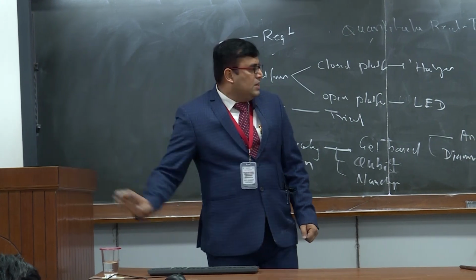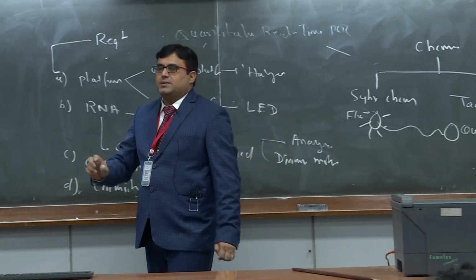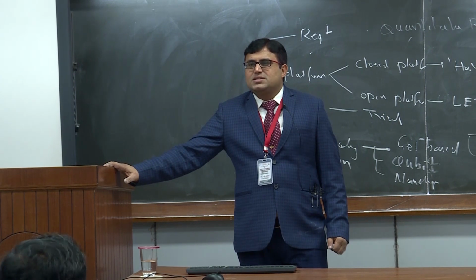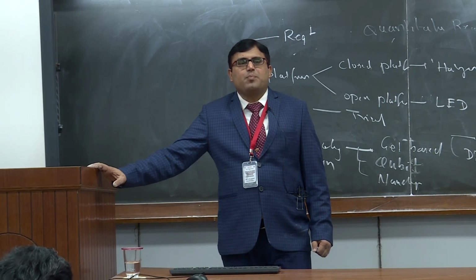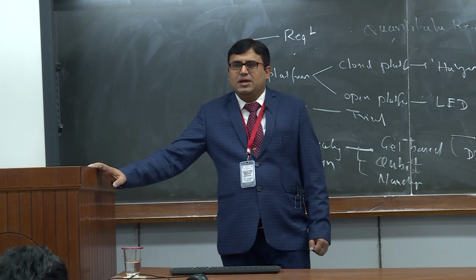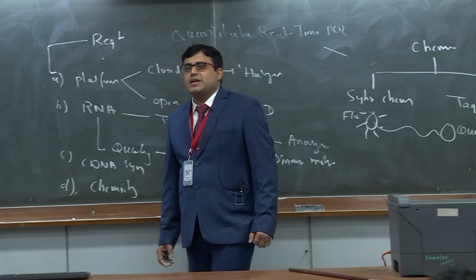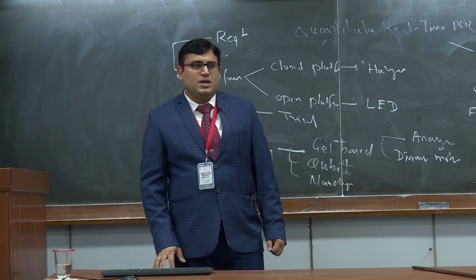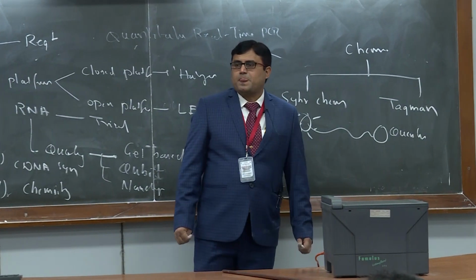In case of SYBR-based chemistry, the expression which you are going to analyze is very relative. It is not so accurate. It is just approximate expression, so it will not give you the exact expression of the gene. But in case of TaqMan, since this is per template basis, whatever expression you get is exact. Accuracy is very high in case of TaqMan-based chemistry.